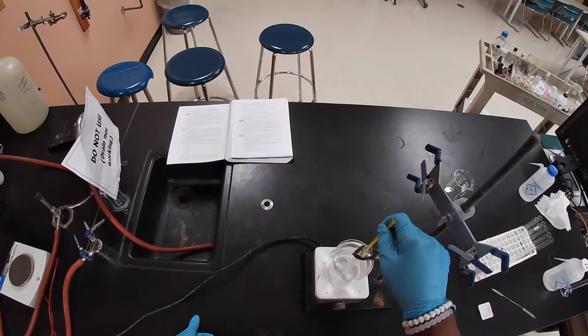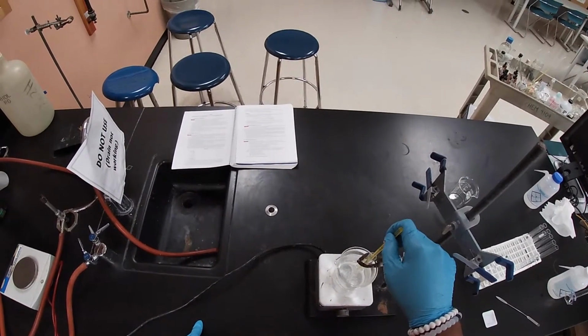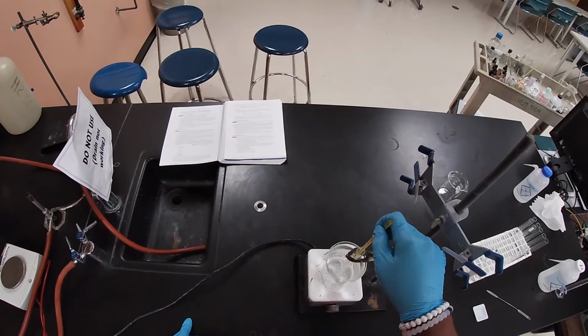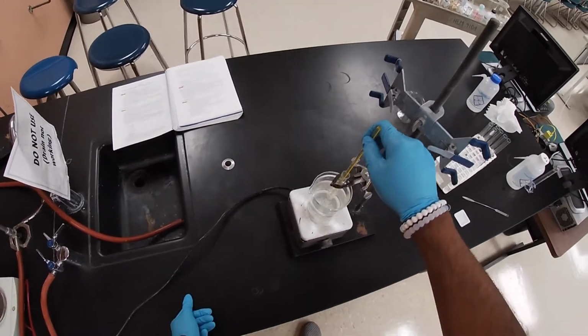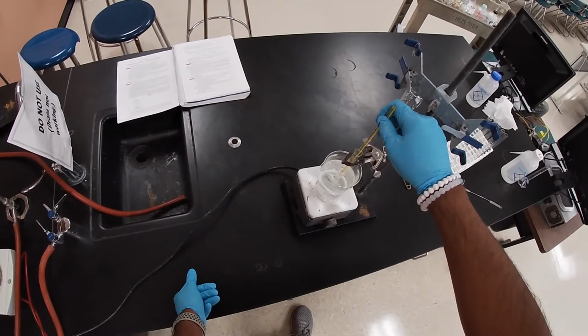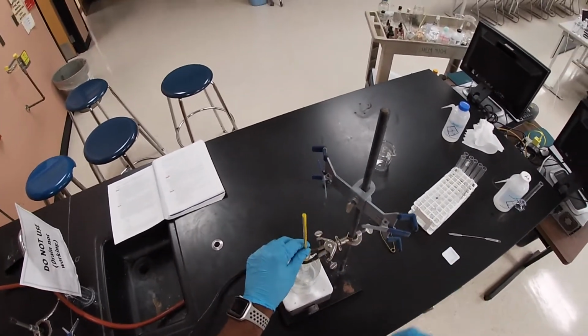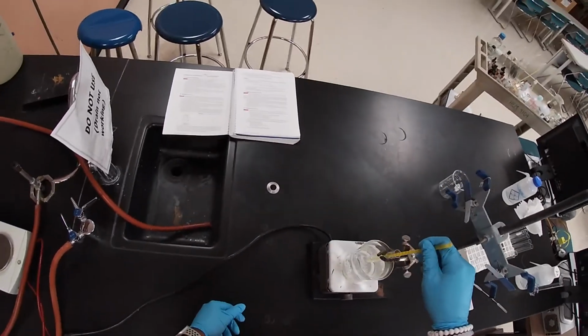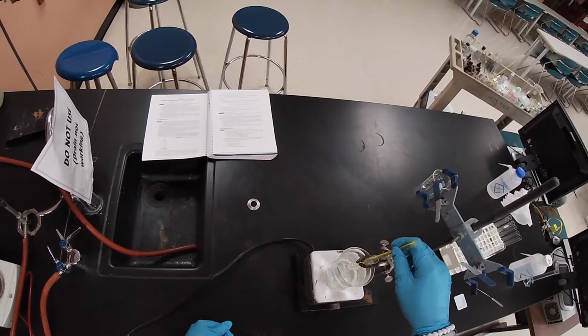I gotta allow it to cool, and I'm just gonna leave the thermometer in there. And then I gotta record the temperature as it's forming its crystals, right?